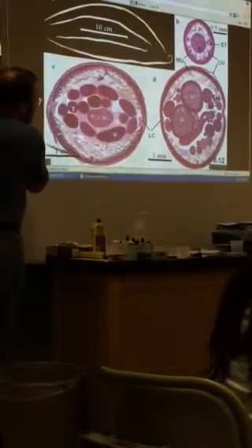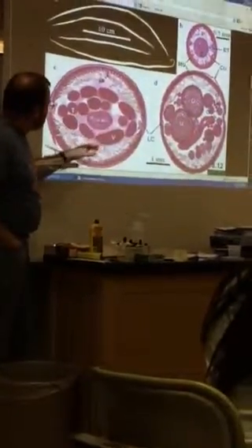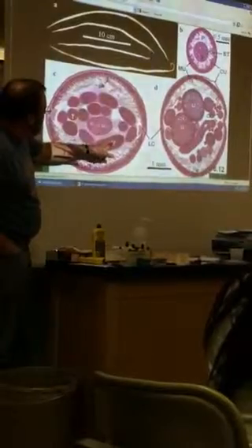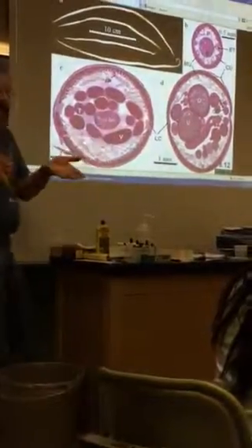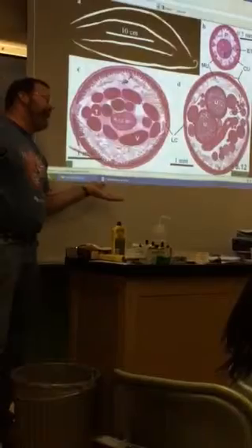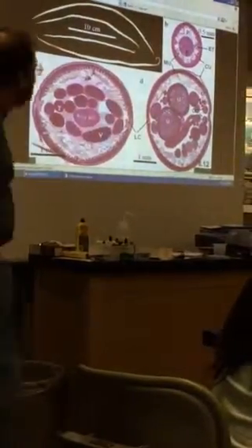Now he has this one labeled a little different than maybe the handout I gave you. I learned that testis and then the medium-sized stuff is vas deferens. And what he's got a V on here, I would probably call seminal vesicle. So I don't want to cause confusion. Go with what's on the handout, and you'll be fine. If we get to the test, I happen to ask that one, and I counted wrong, remind me that Sullivan said that was vas deferens. I'll probably give it back to you. But go with what's on the handout that I gave you as far as that goes.